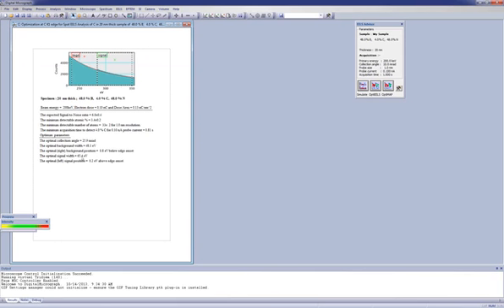And the important point is that these answers will depend quite critically on what the acquisition conditions are and what the sample is. So if you have complicating effects associated with adjacent edges, then the answer for detecting this amount of carbon will differ. And this is really where the software stands out. It's aimed to provide the user with some guide based on what the parameters are that you're dealing with in terms of the sample and the acquisition conditions as to what you can expect from your EELS experiment and how best to optimize the data that you gather.